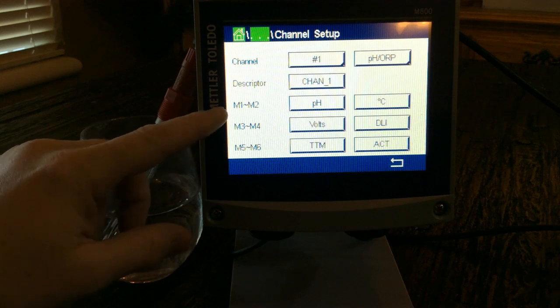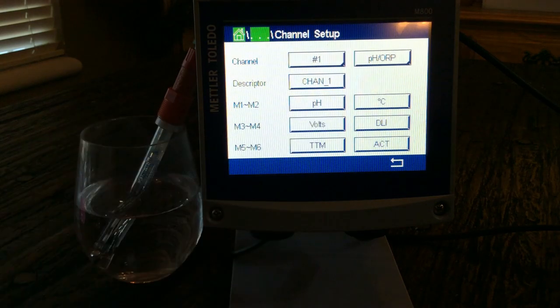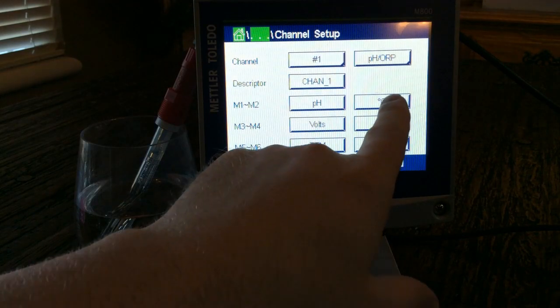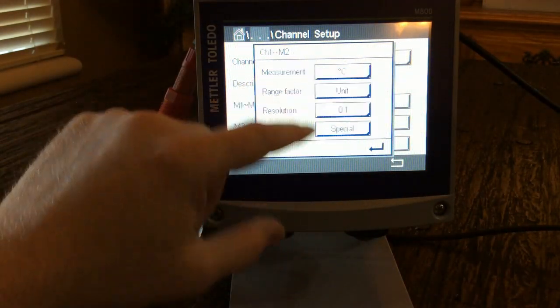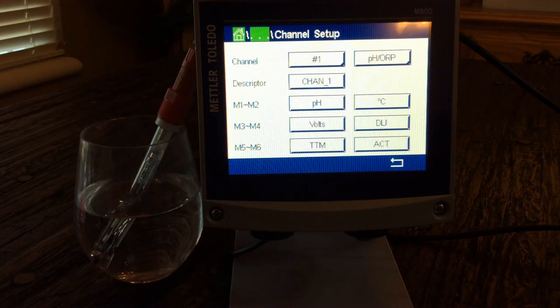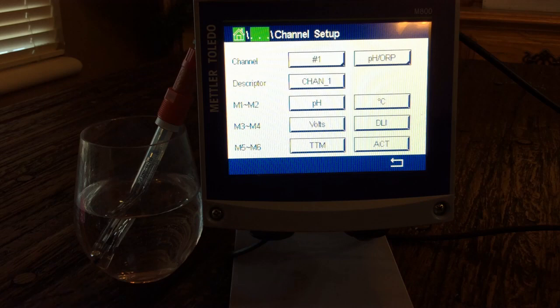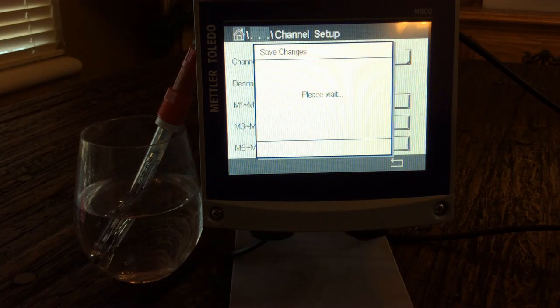Under measurements M1 through M6, I have it set to pH and Celsius. You can switch to Fahrenheit if preferred. You can also display millivolts, dynamic lifetime indicator, or calibration timer — there are many options to customize what you see on screen.